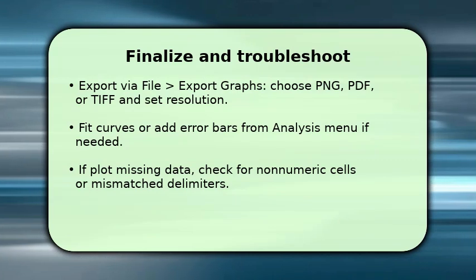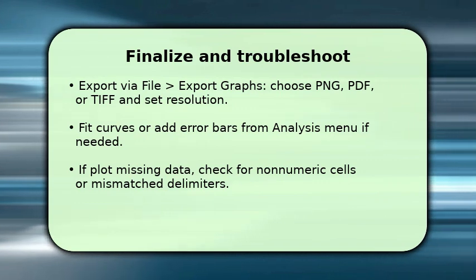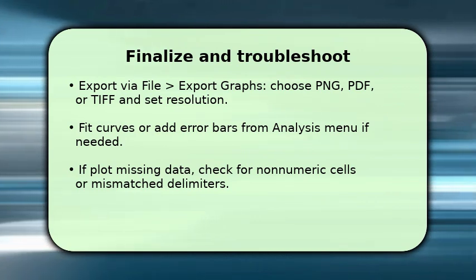To finish, polish your graph by adding annotations, fit lines, or error bars from the Analysis menu. Once satisfied, export using File Export Graphs and pick Format and Resolution for your audience. If you need reproducibility, save the project file.